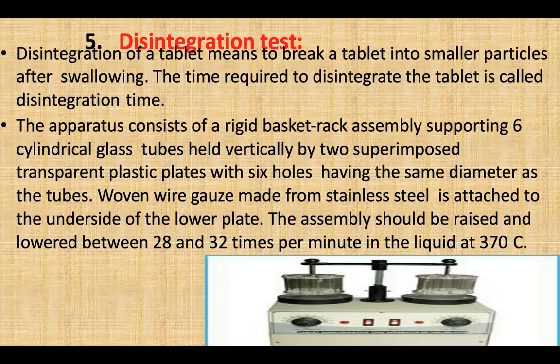So for the disintegration test, disintegration of a tablet means breaking a tablet into smaller particles after swallowing. The time required to disintegrate the tablet is called disintegration time. The apparatus consists of a rigid basket rack assembly supporting six cylindrical glass tubes held vertically by two superimposed transparent plastic plates with six holes having the same diameter as the tubes.